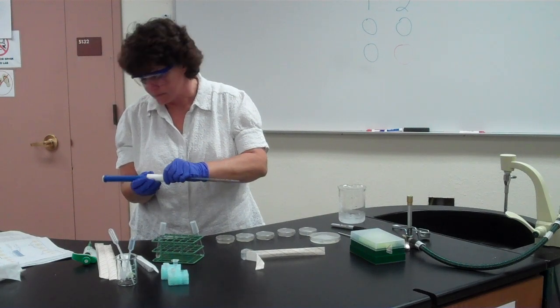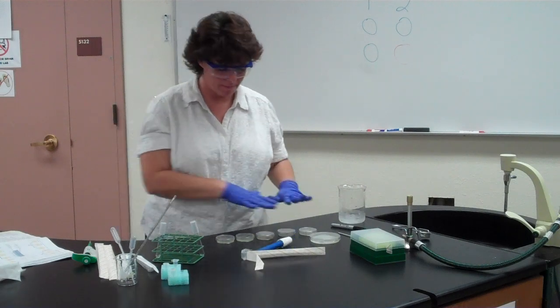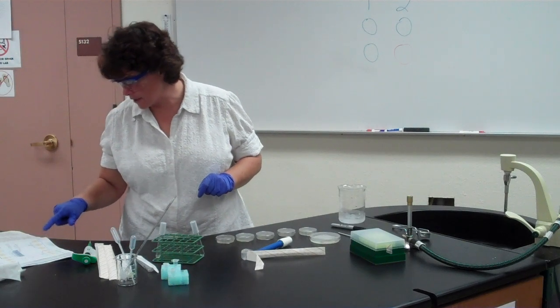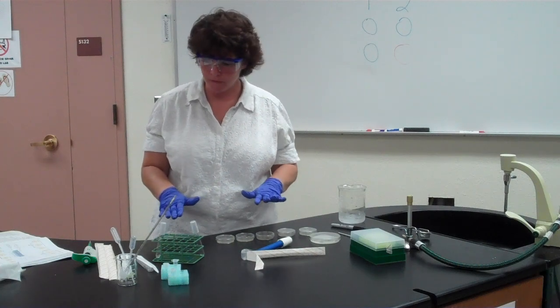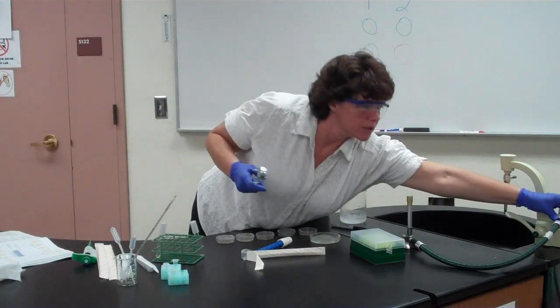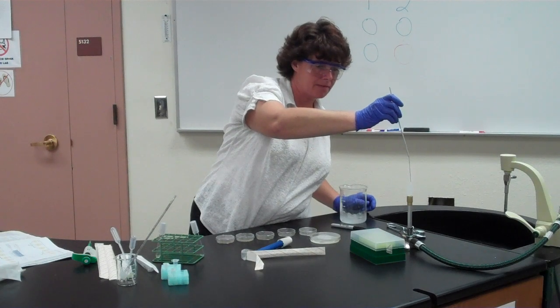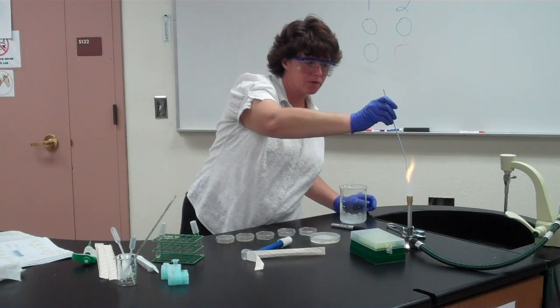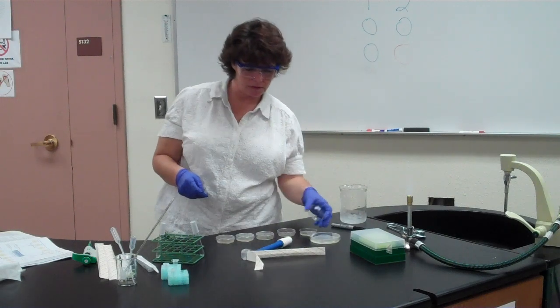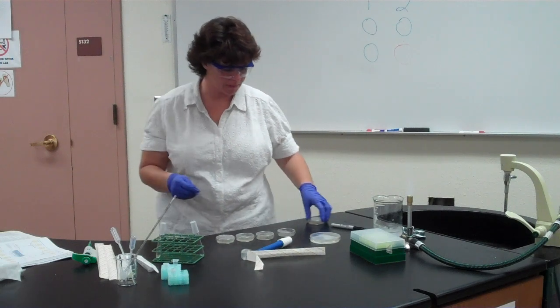You can use one pipette for all the positive plates and a separate one for all the negative plates to avoid contamination. Instead of using six glass beads for spreading as the book suggests, use your inoculating loop. Flame the loop at the Bunsen burner — someone can be sterilizing the loop while another person is dispensing the liquid. With groups of three, one person dispenses, one holds the lids, and one sterilizes the loop.